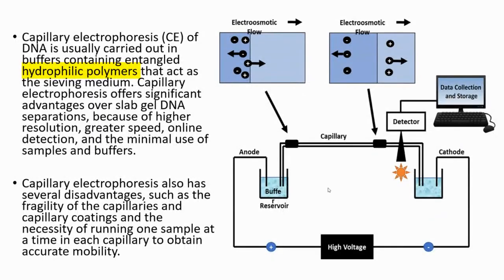Capillary electrophoresis is another alternative to conventional gel electrophoresis for separation of DNA fragments. Basically, capillary electrophoresis has advantages because of speed, resolution, sensitivity, and data handling. To separate the DNA fragments takes only a few minutes, and it also gives very high resolution.